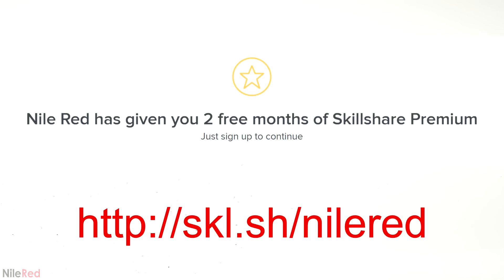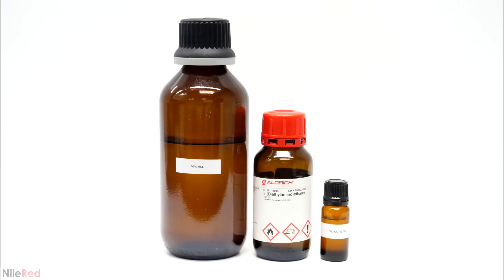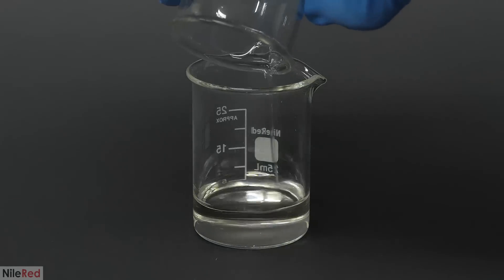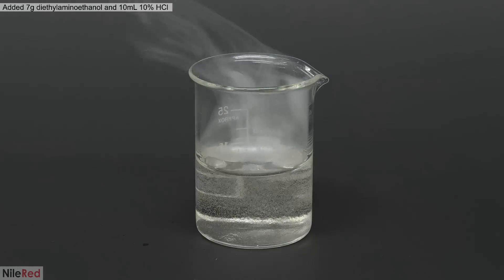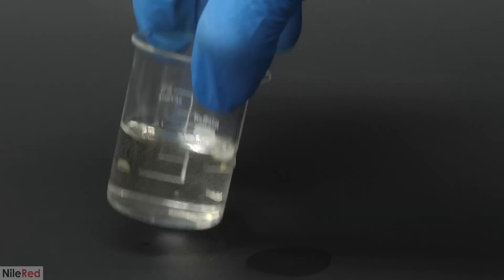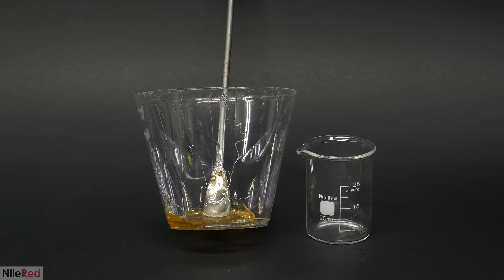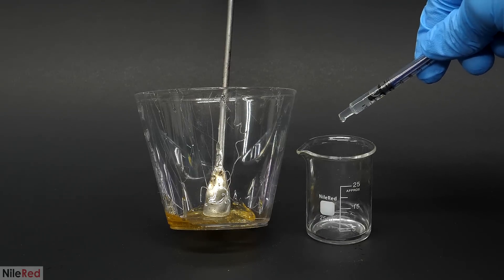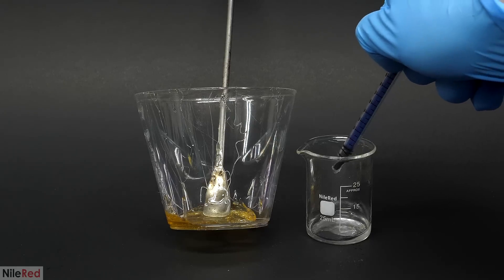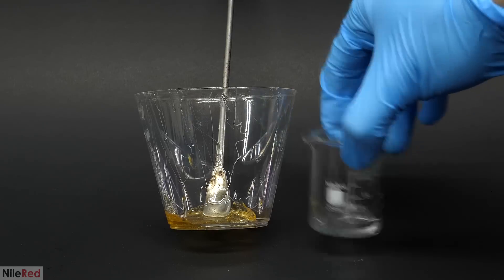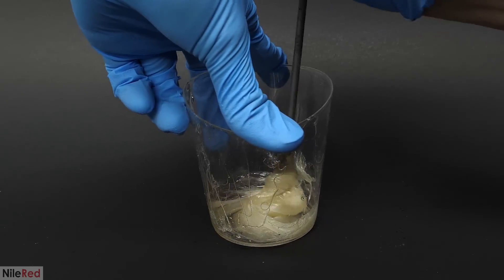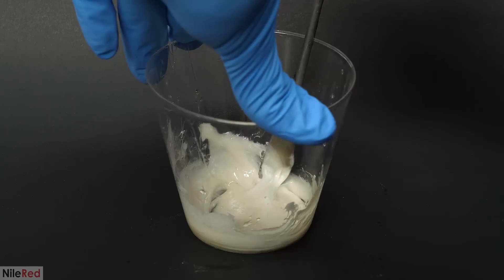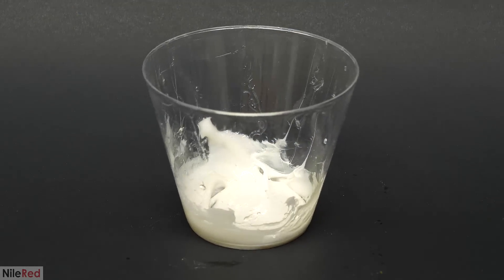Anyway with that being said let's get back to making the foam. To do this I needed a few ingredients and they're all shown here. The first step was to make a buffered catalyst solution by adding 7 grams of diethyl amino ethanol followed by 10 milliliters of 10% hydrochloric acid. I swirled it around a bit to really mix it up and then I placed it on the side. In a plastic cup I weighed out about 5 grams of the pre-polymer and in the beaker on the right I prepared the catalyst mixture. I added about half a milliliter of water, 2 drops of silicone oil and 0.175 milliliters of the buffered catalyst that I just made. With everything added I gave it a quick mixing and I dumped it into the pre-polymer. I then stirred it around for a couple minutes and it slowly got whiter and whiter due to the production of CO2 gas. When I felt like it was evenly mixed I took out the spatula and I let the reaction do its thing.